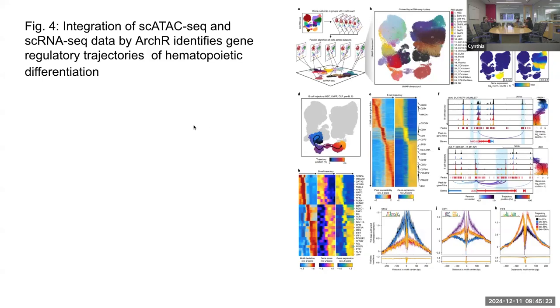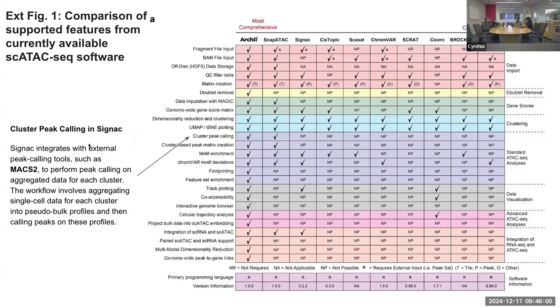Also, I don't go deep into this, but they have a full figure to explain how they could integrate an approach without the necessity to import external tools to identify cell trajectories. They have a very long explanation about how this can be done, so I just want to mention that this is possible. This is not part of the analysis that I actually ran, but they incorporate this feature here.